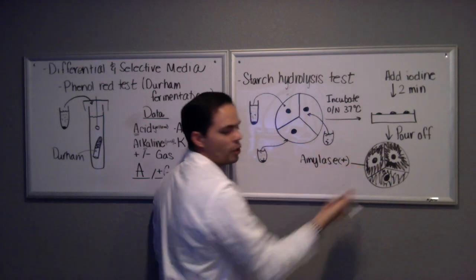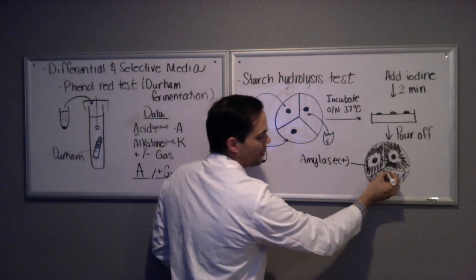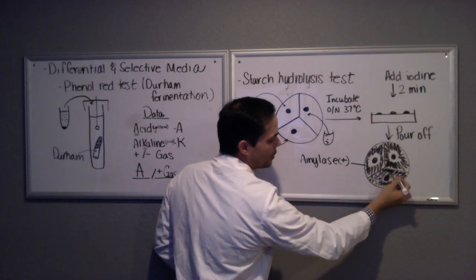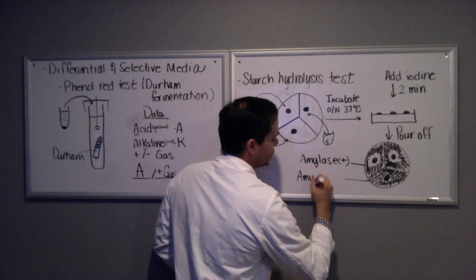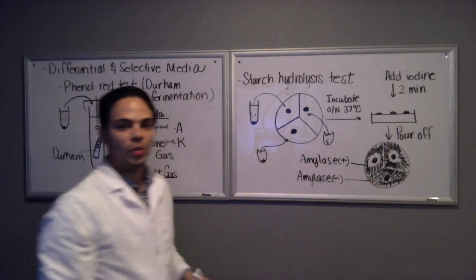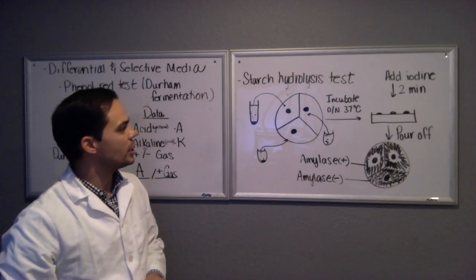This one does not have a clearing around it. Let's say that the starch is all the way around, there's no clearing. This one would be amylase negative. And that's how you would record the data for this particular test.